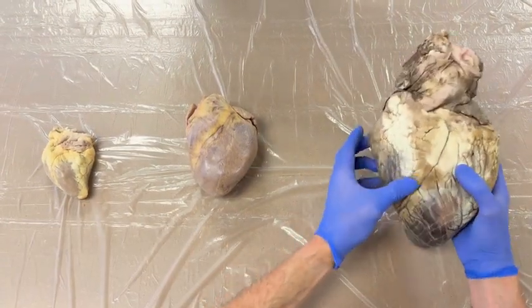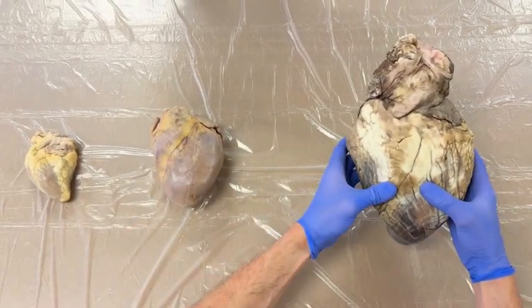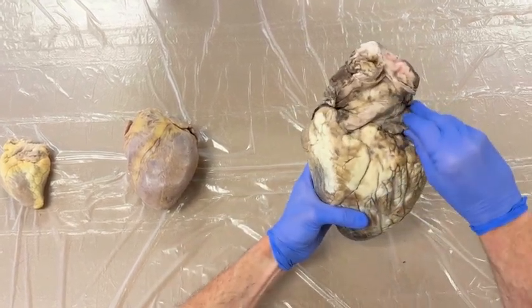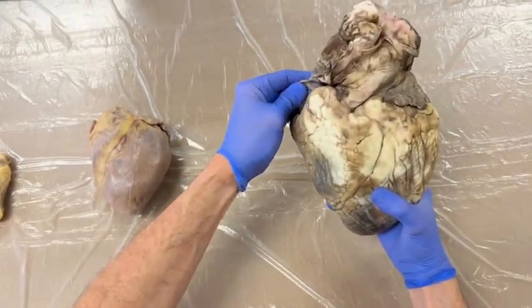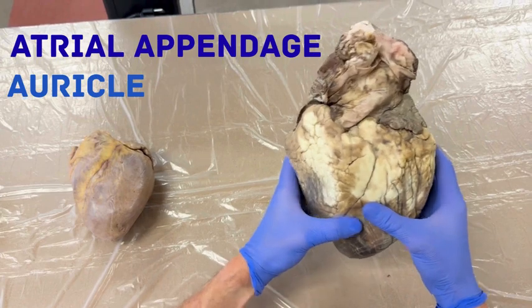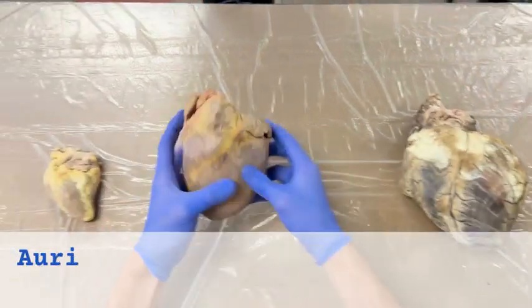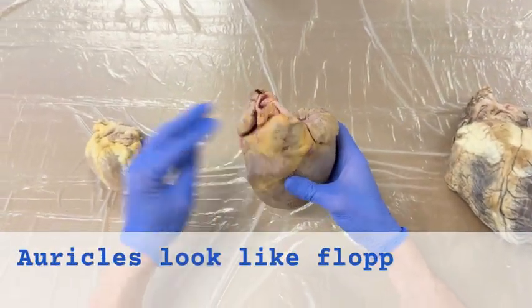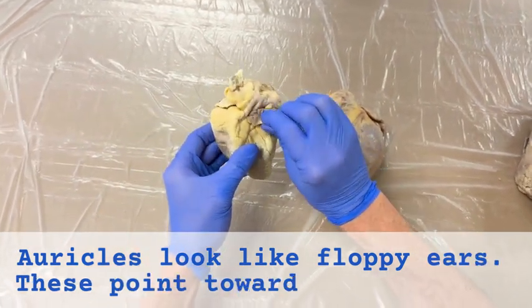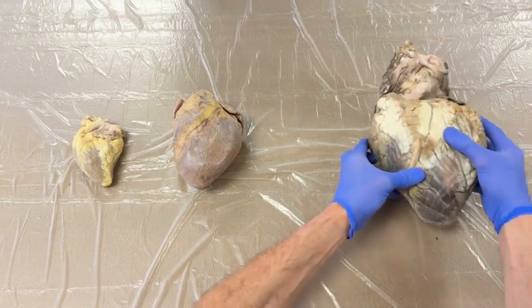Next we want to identify front and back. This can be a little trickier in some of these specimens after they've been removed. One of the key features that I find is trying to identify the appendages at the base of the heart. These are called the atrial appendages or auricles. That word also means ear, and they kind of look like floppy ears. Each of these hearts has auricles, and these always point toward the front, which is the biggest clue as to the front of the mammalian heart.